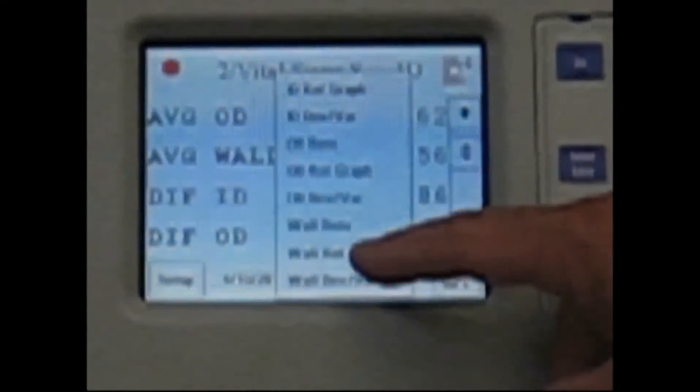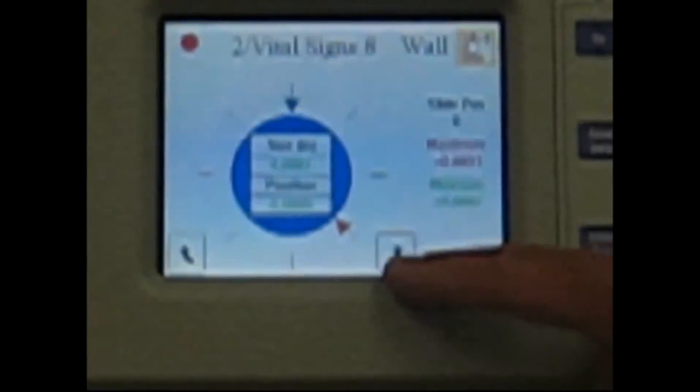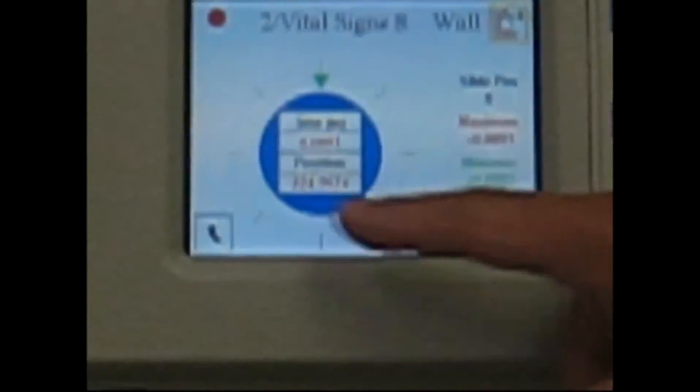You can then press this button again to go and look at the wall graph, to look at the readings, graphical readings, and then index around to look at the wall thickness around the circumference of the tube. The degree indicator is at the bottom of that graphic that's shown there.